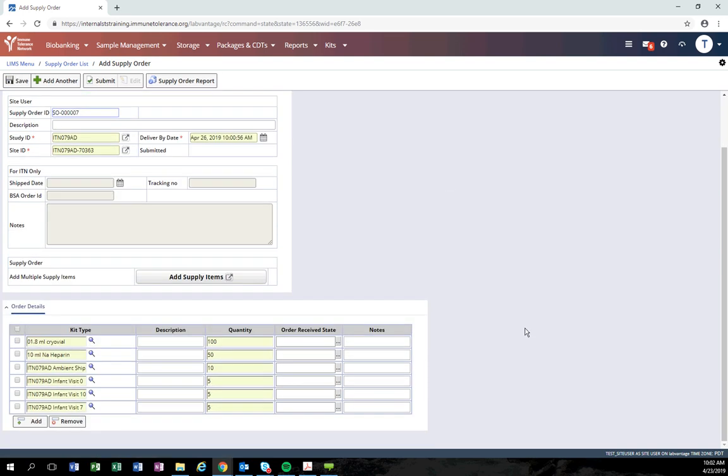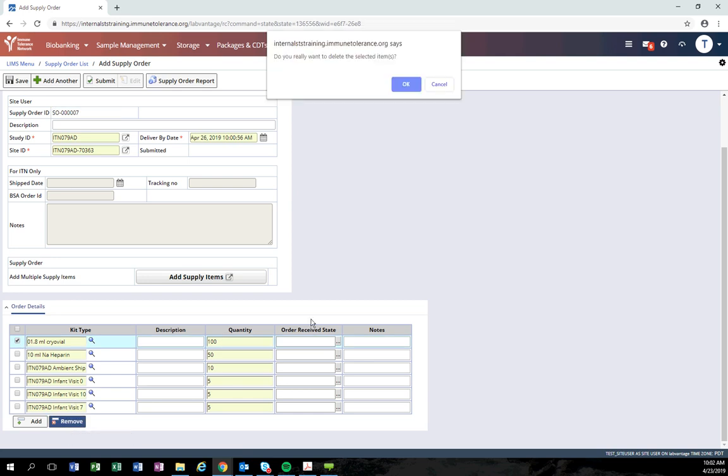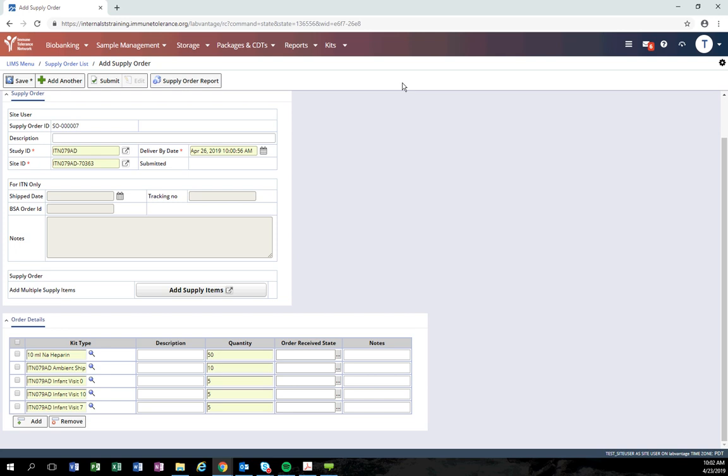If you realize that you made a mistake and you don't need a certain item, you can click the checkbox next to that item and click the remove button.